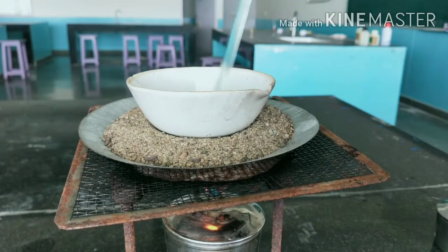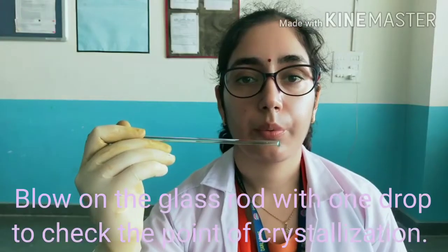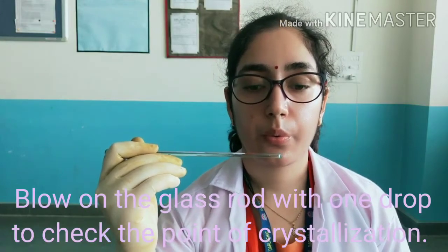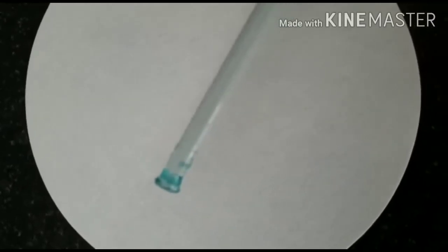and the point of crystallization can be known by taking one drop over the glass rod and then blowing on it. After blowing on it, the crystals will form.